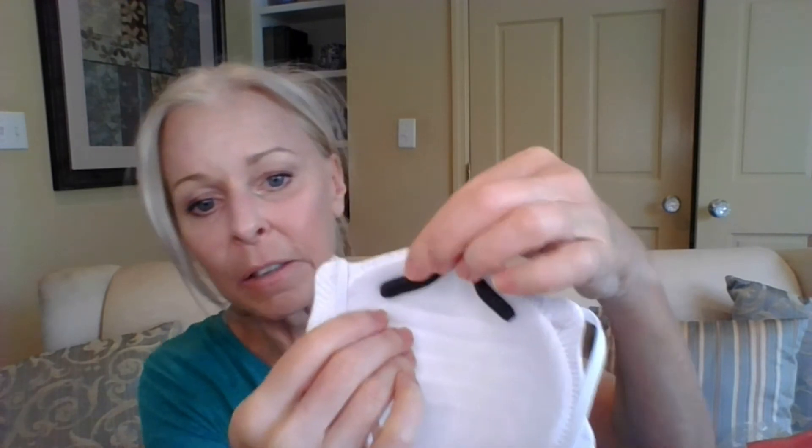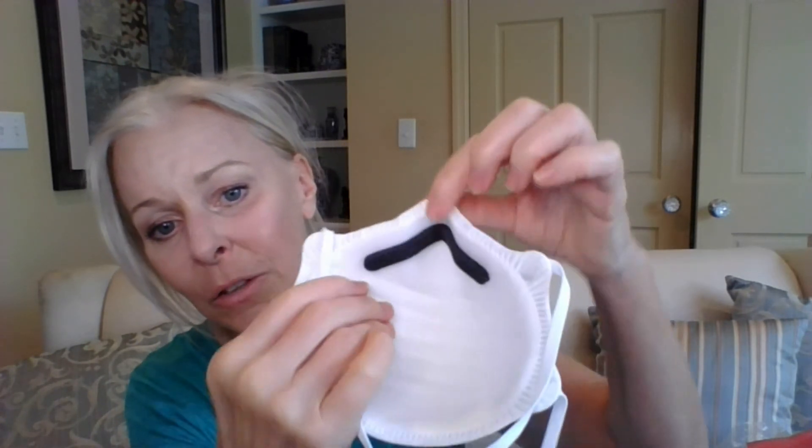I hope this passes the test and receives its NIOSH approval, because I think this might be a really nice option for people who like this more sturdy feel dome that keeps the mask away from your nose and mouth. The tradeoff is there's quite a bit of distance between the nose piece and the top of the mask. In my case with a very petite face, that means I've got this mask pretty high up, and given how thick this is and how far the dome comes out from my face, it creates a congested area right there. That's why I had to place my goggles differently than normal. But if this is something you prefer — this harder dome — I think that's actually a very reasonable tradeoff, and I will definitely use these.